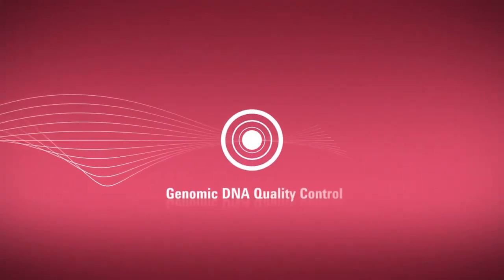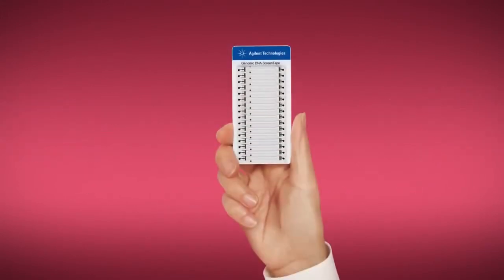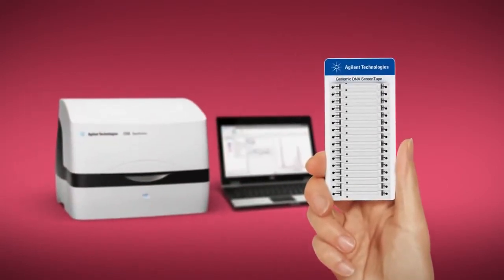Quality control of genomic DNA is an important step in your workflow to ensure confident results downstream. Let Agilent Genomic DNA ScreenTape and the 2200 TapeStation system streamline your workflow.